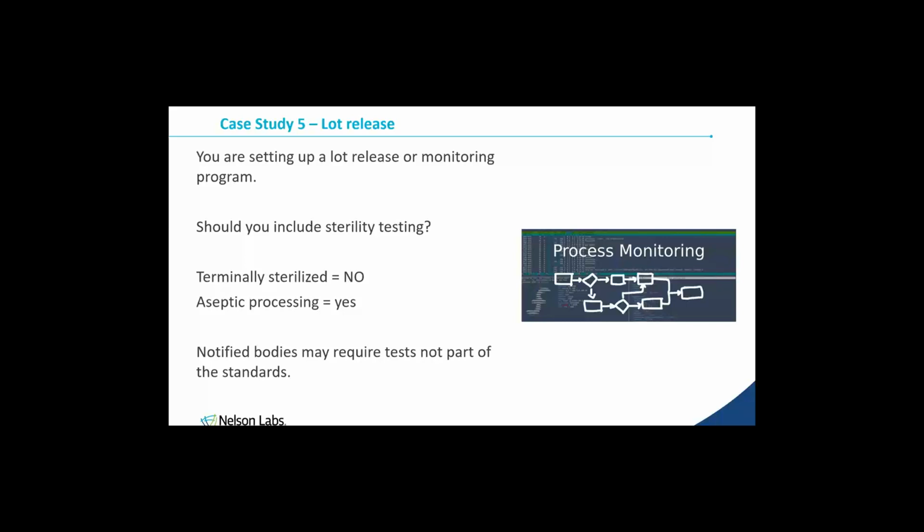And it's kind of a sad situation. We've seen it before where people do this to appease the auditing body, and they do have a positive test of sterility. So then it leads to a whole investigation and looking at the lab. And chances are fairly reasonable that, and we saw it with the 30 samples tested, 1 positive, lab contamination does happen. But trying to just pin product safety on lab contamination really doesn't demonstrate improved product safety.